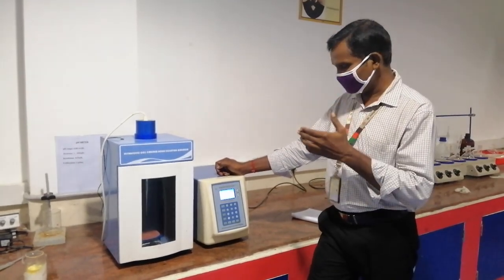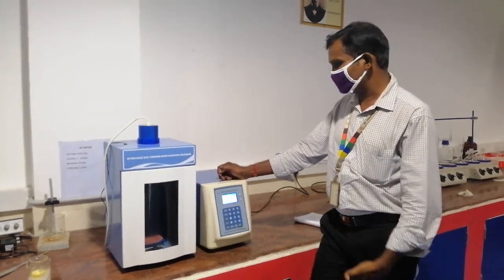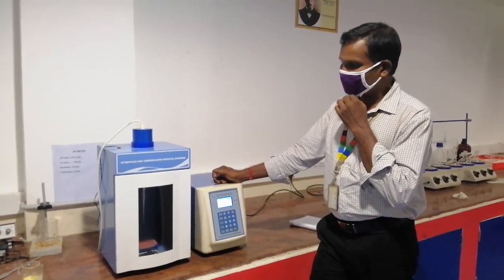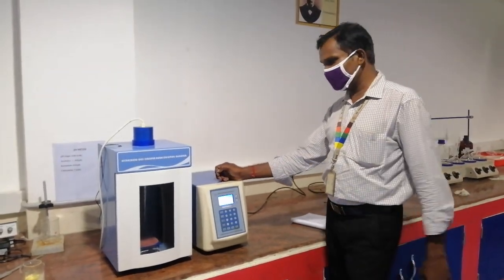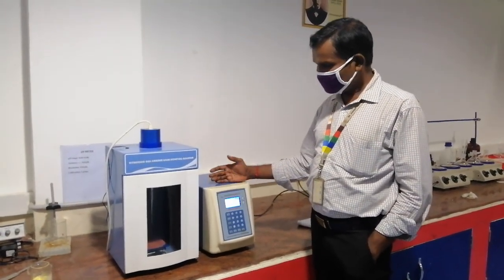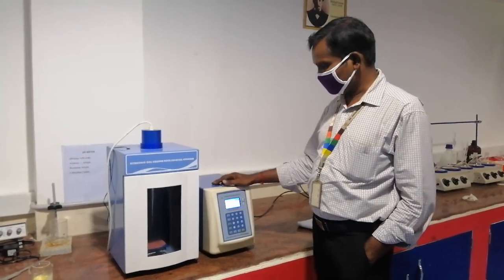After 30 seconds, you have to take a sample. The second cycle is another 30 seconds, so the total time is 60 seconds. Then the third cycle is another 30 seconds, so the total is 90 seconds. Similarly, you repeat it 10 times, so you will have 10 cycles. The same cell slurry disrupted after each cycle is taken as the feed for the next cycle.